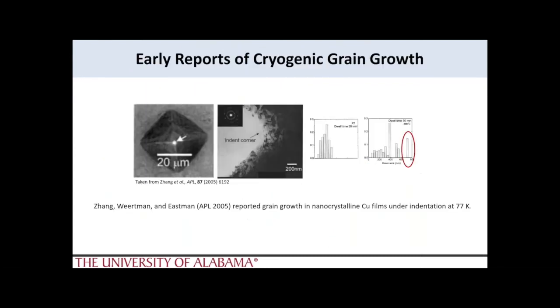So I want to begin the talk by where we started with PED. Not that I need to follow a chronological order, but I think it indicates how powerful PED can be in understanding outstanding questions of materials science. This first one isn't necessarily in situ, but I think it sets the stage for what it can provide, and how applying it to in situ, for example deformation or heating experiments, can provide a lot of really good insights.